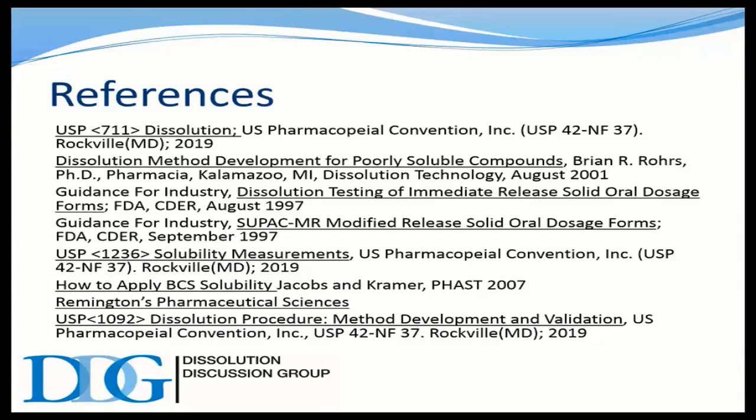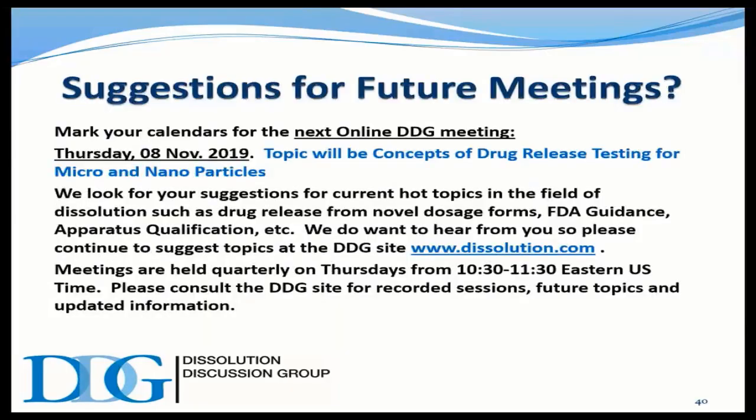And then, of course, there's various guidance for industry from FDA that have been very helpful, including SUPAC, and then the USP chapters 711, 1236, 1092, which can be quite useful.